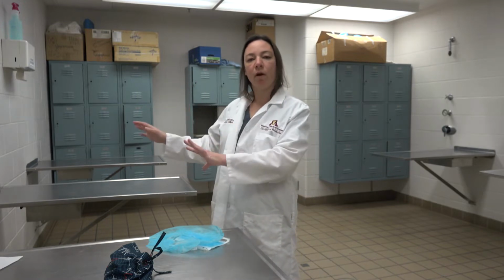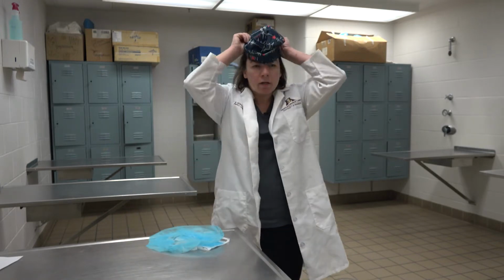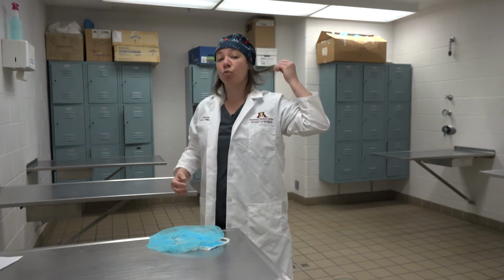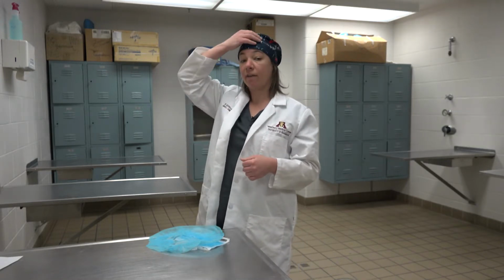The other thing we need when we go into the surgery suite, cap and mask. Now, what a lot of people want to do is put one of these super cute, nice caps on, but then their hair's hanging out. Now, this is great for food service. It's fine, because you get a hair in your food, no big deal. It's not going to poison you. You get a hair in your patient, and unfortunately, that means an exponential increase in infection rates.